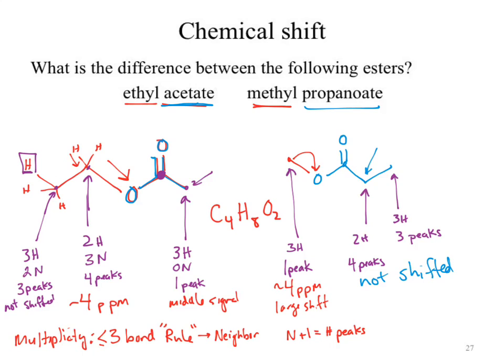Those of you that have done practice with this may realize that once you've got all your pieces together, you may find there's 2 or 3 ways you could have arranged those pieces. Esters, there's always at least 2. And there is no evidence to tell you otherwise until you look at the chemical shifts. In the other situations, you usually have something else to help you piece it out. Here, it's only the chemical shift.